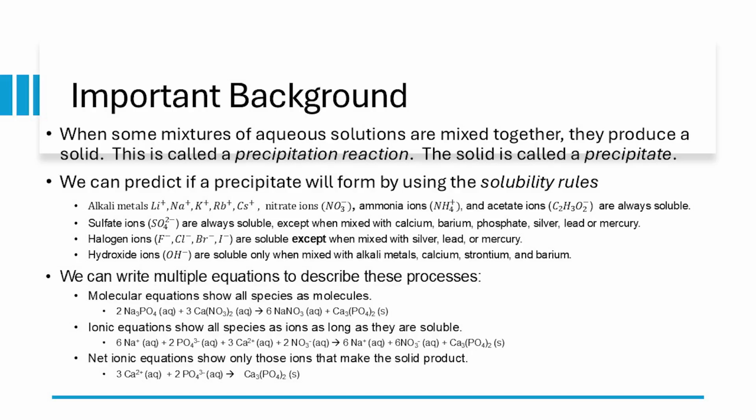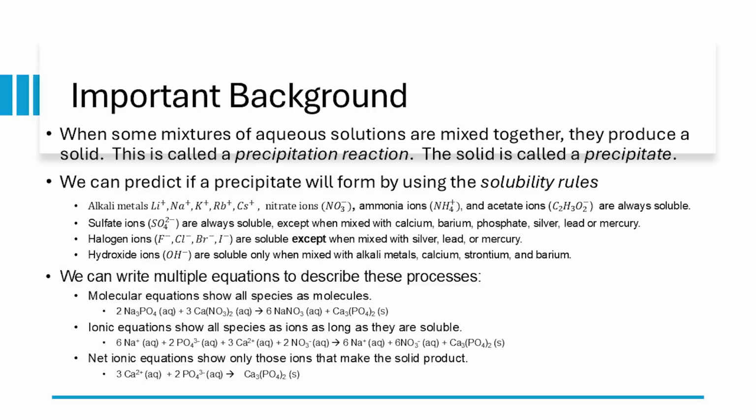In addition, once we've observed the reactions, particularly the ones that made a solid, we're going to call those actual reactions. If they don't make a solid, it's a no reaction. We're going to write the equations for those. First, we're going to write the molecular equation, and those are the equations you're more familiar with, where you write the compound's formulas with their coefficients.